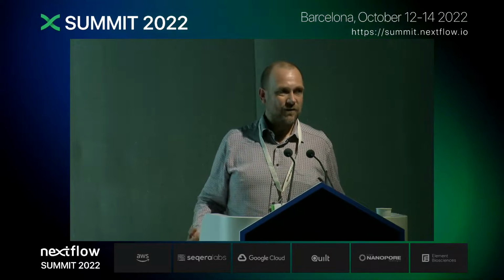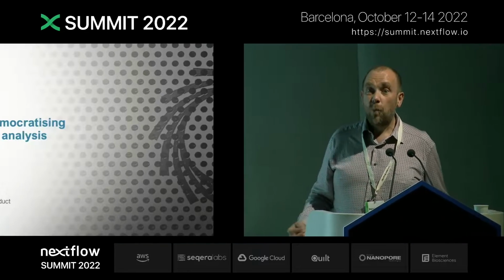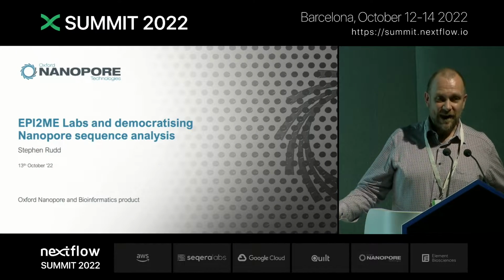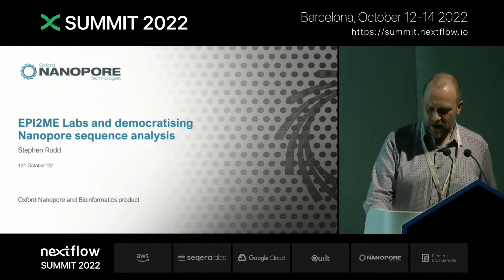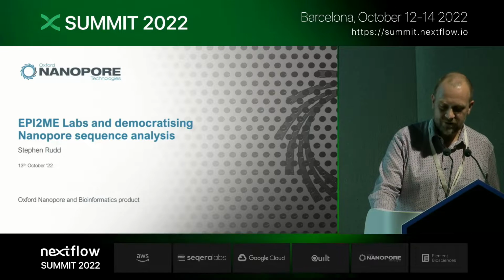Anyhow, I'm in the product management team, and I'm responsible for the bioinformatics product at Oxford Nanopore. So over the next few slides, I'm going to try and explain what our product is, where our product came from, and what we would like to see our product evolve into in the coming weeks, months, and years.